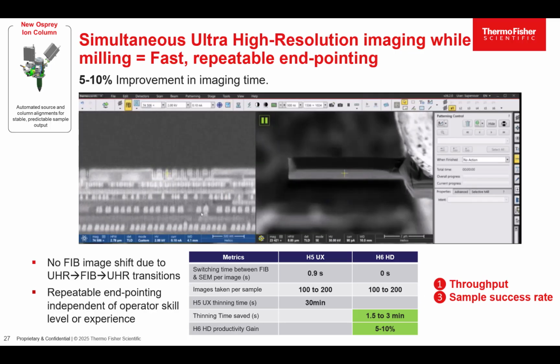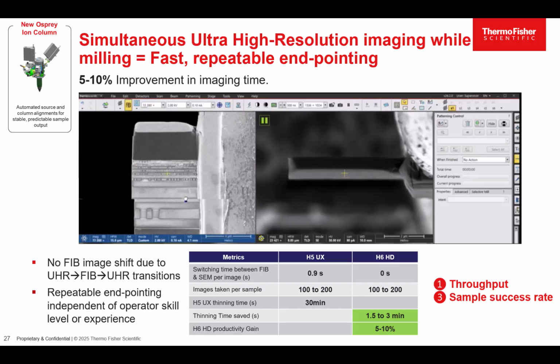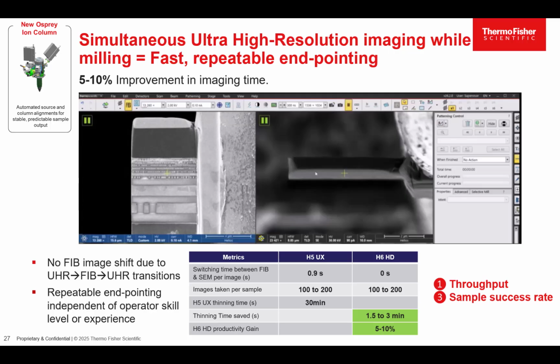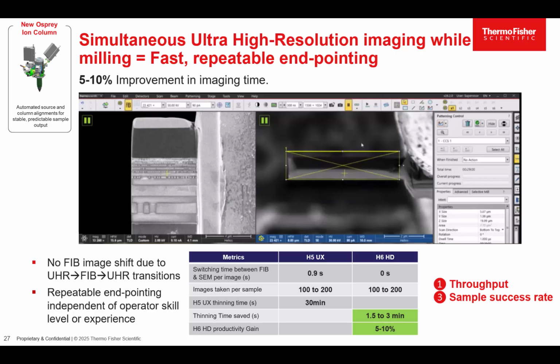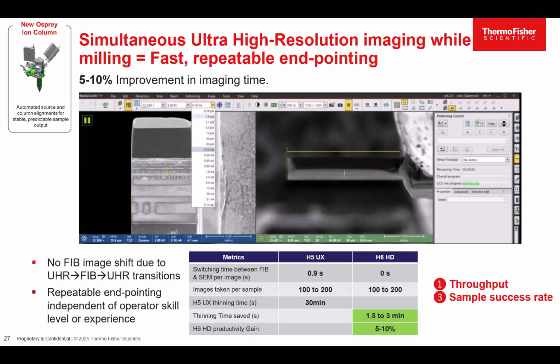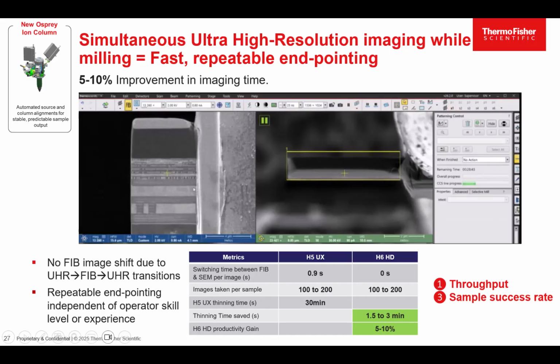It's cool. This is a FinFET device. You can see the little fins there, the gate all around it. And this is an inverted sample, so the silicon's on top. Okay, and they're starting the FIB mill. Cranking up the beam current. Notice over here that we are in immersion mode and we're in FIB immersion mode.